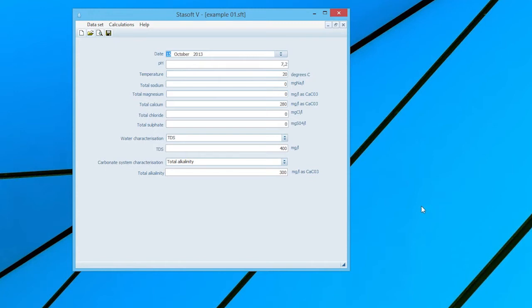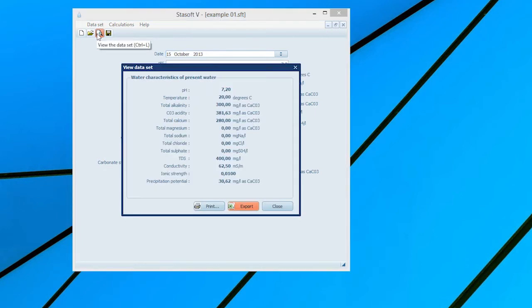The third command of the Data Set menu option allows the user to view the current characteristics of a water by selecting the View command, resulting in the Water Characteristics menu appearing on the screen.